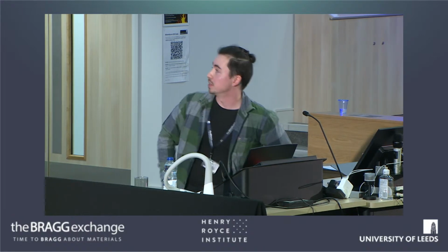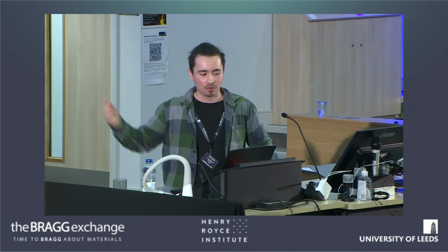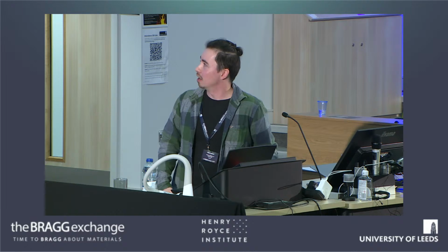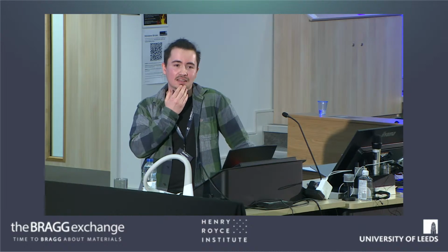It's hard to say. So sometimes when it fails, what you'll see in some of these images, trying to think how to word it. So this image is quite a good image, but it's not brilliant. And a lot of it, when it comes down to us labeling stuff, is down to our opinion of what's a good image or a bad image. So I would say that's good, but say my supervisor would say that's rubbish, go back and do it again. So yeah, a lot of the time it does come back to that. It comes back as well to, when we use the cross-correlation, what we use for our reference image and stuff like that. So it's how you can prove to your supervisor that you're right. Exactly, yeah.